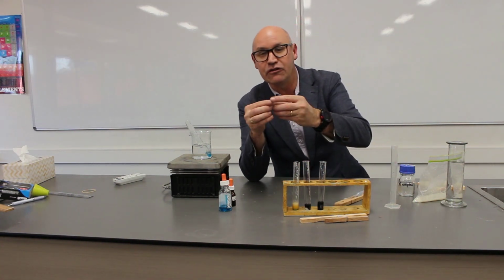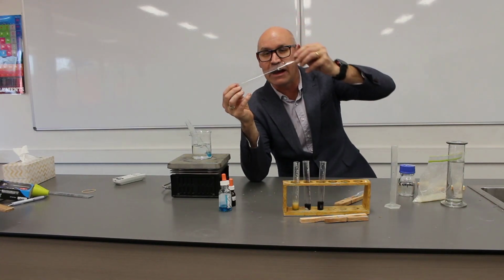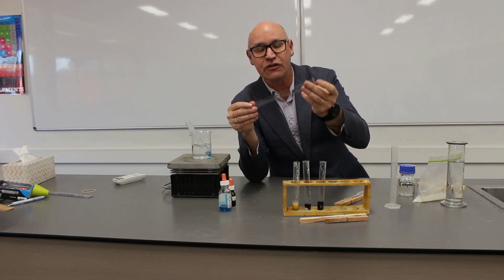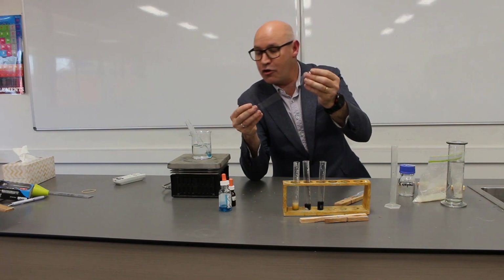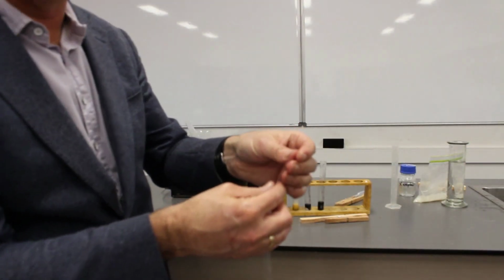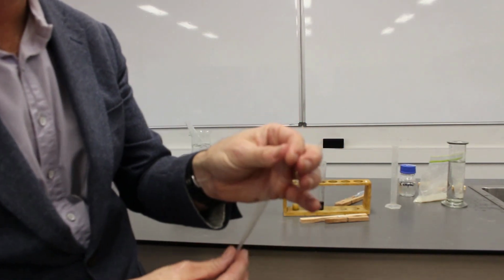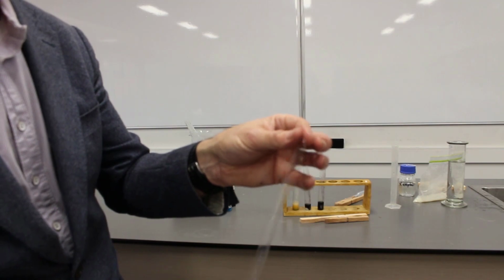We're going to use this tubing here. This, you probably can't even see this, is called dialysis tubing. Now, believe it or not, it's got ever so small holes in it. Now, the way we open this is by running it under water. Let it run under water for around about 30 seconds, and then to open it up, all we do is we run it back and forth like this between our finger and our thumb.